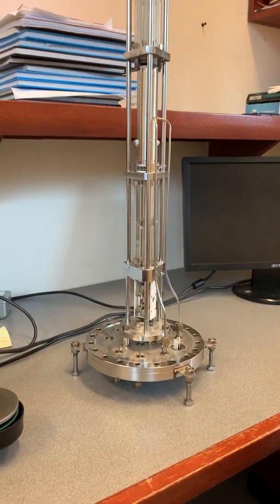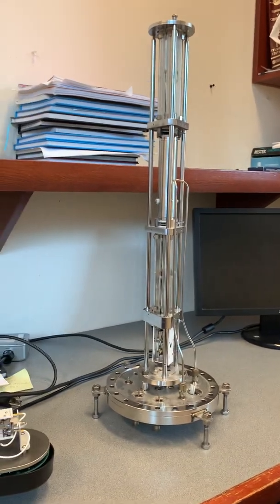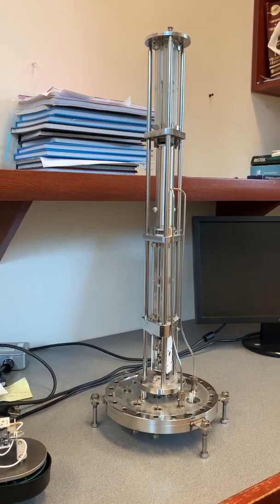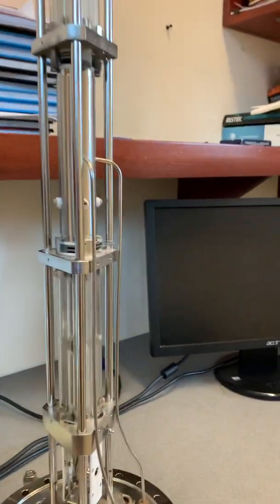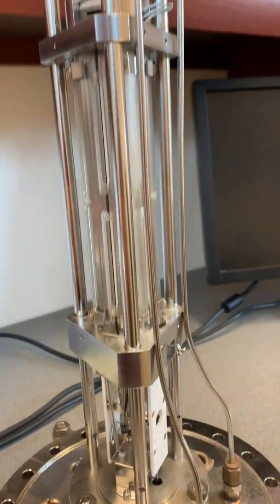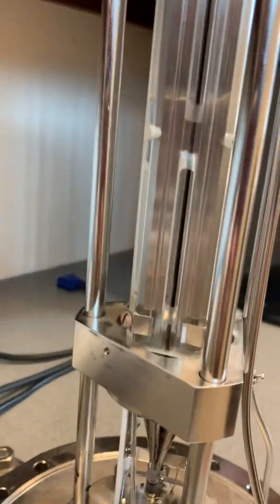Welcome to the John Irons Mass Spectrometry Facility. I'm Sharon Curtis and I'm going to try and explain to you how a quadrupole mass spectrometer works. I've collected together from the lab various show-and-tell items, and you're looking straight at a triple quadrupole. Here is the top quad where the ions would enter, down through the middle into the collision cell, which is another quadrupole, and then down here is the third quadrupole with a small detector at the bottom.